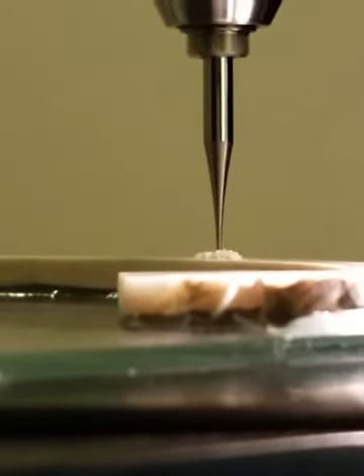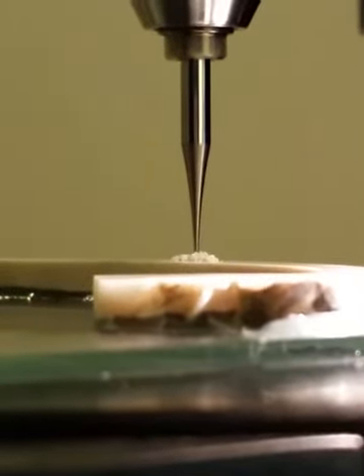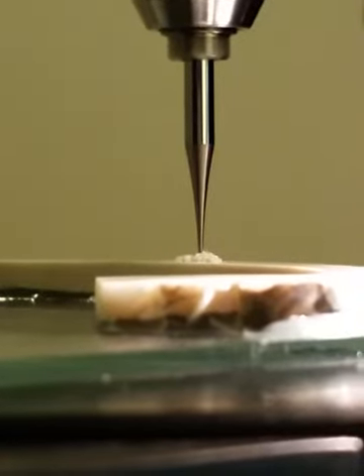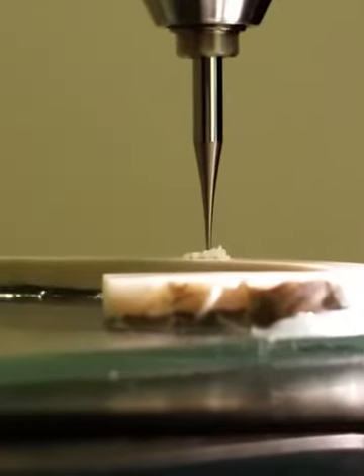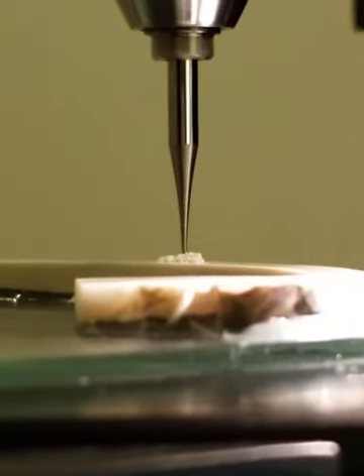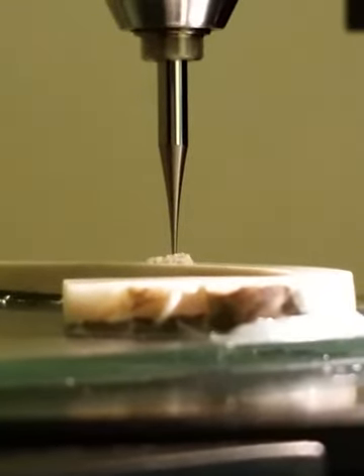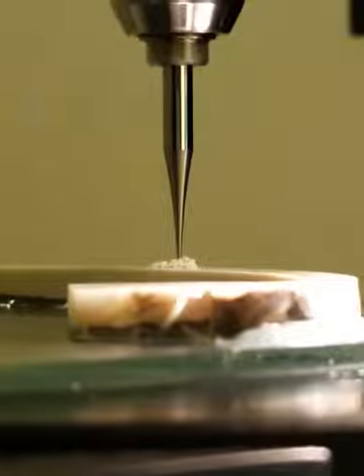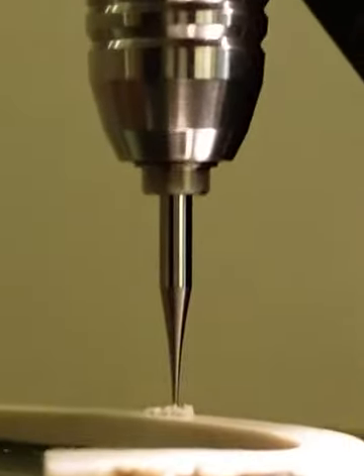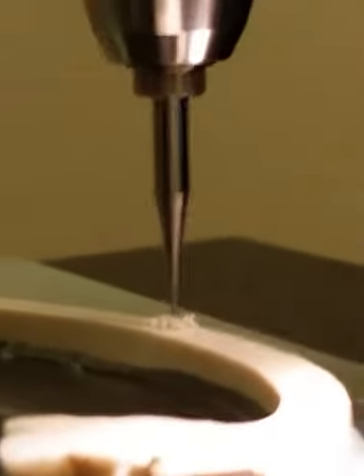Well, maybe I do 3 passes for my stuff. I remove the first layer, which might be the most contaminated, and I recover the powder from the second and third pass. Yep. Yeah, might work. Yeah, that's a good angle.